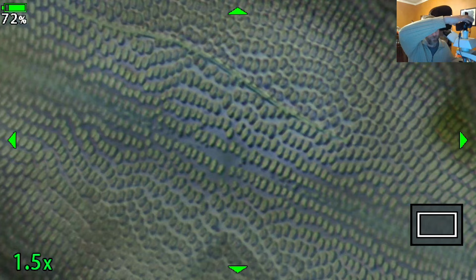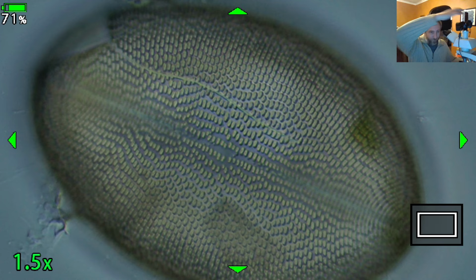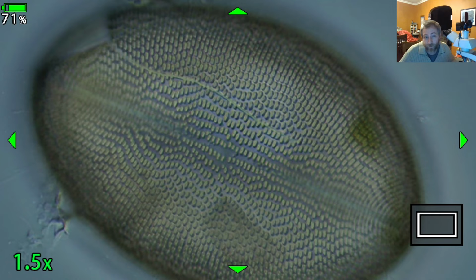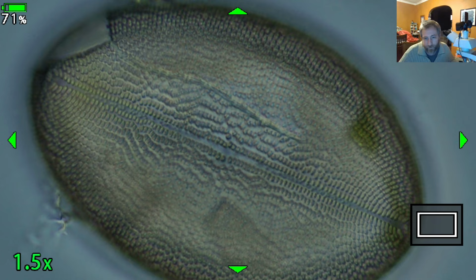We can also zoom in very easily with this one to crazy levels. I can tell you from looking in the eyepiece, that diatom that we're looking at right there is around 75 microns long, and its width is something like 50 microns. So it's actually pretty big for a Cocconeis. I'm not sure what the species is just off the top of my head. It looks like maybe it's lineata, but I haven't seen even the raphe valves and looked at them very closely, so I'm not sure.